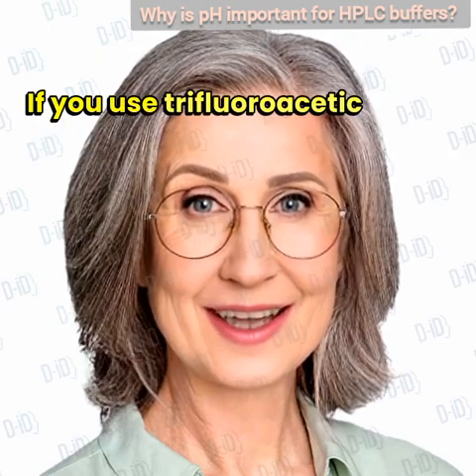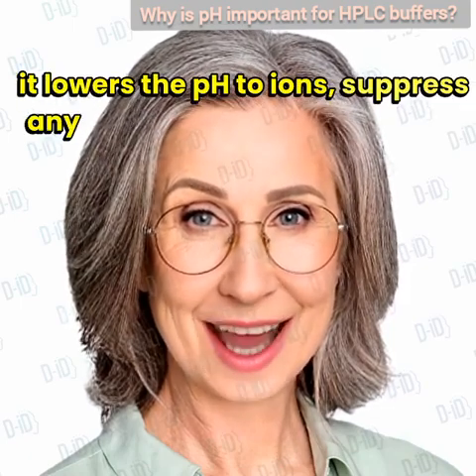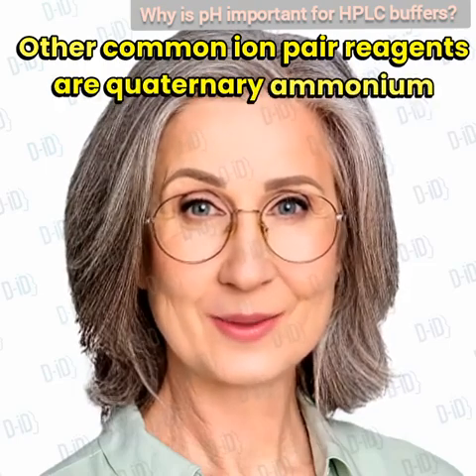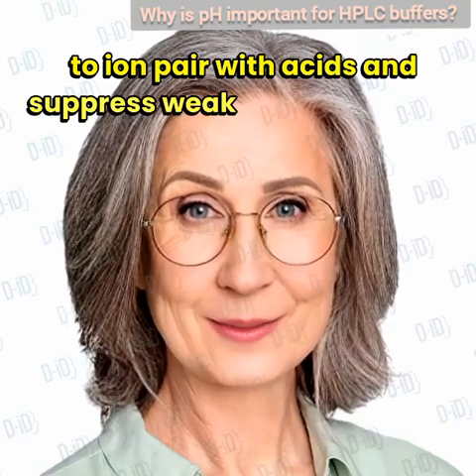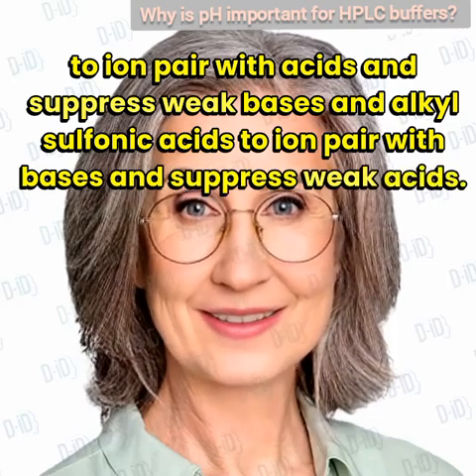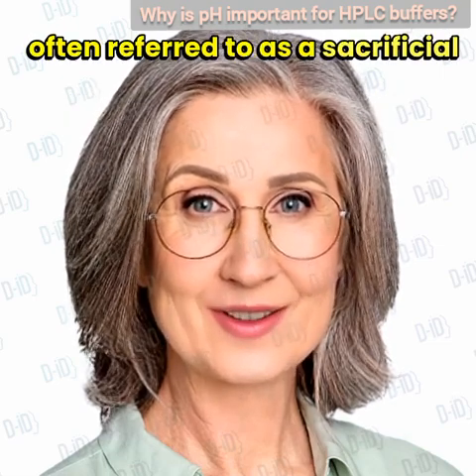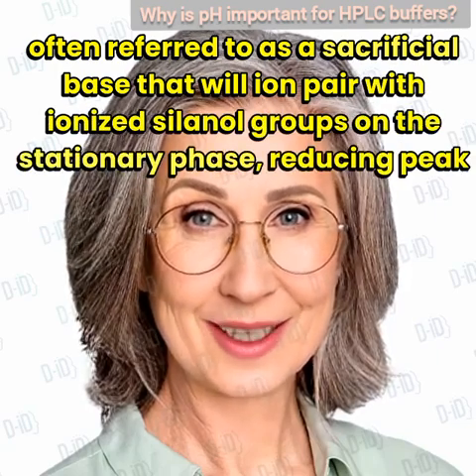If you use trifluoroacetic acid, TFA, in your mobile phases, it lowers the pH to ion suppress any acids, while also ion pairing with any ionized bases. Other common ion pair reagents are quaternary ammonium compounds, for example tetrabutylammonium phosphate, to ion pair with acids and suppress weak bases, and alkyl sulfonic acids to ion pair with bases and suppress weak acids. Triethylamine, TEA, is another commonly used modifier, often referred to as a sacrificial base that will ion pair with ionized silanol groups on the stationary phase, reducing peak tailing effects.